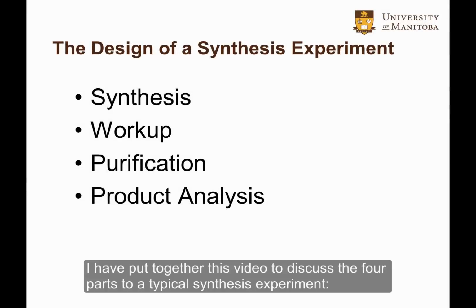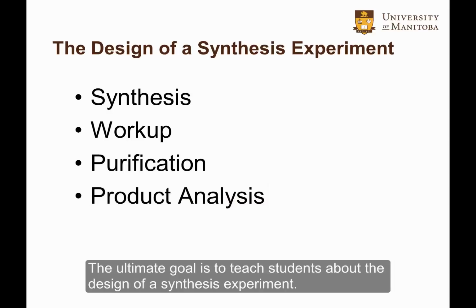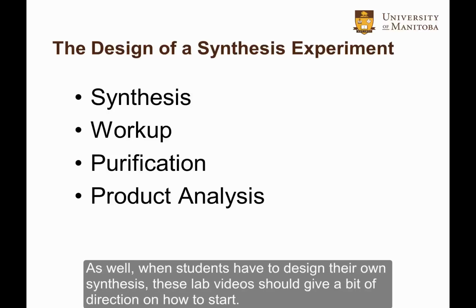I have put together this video to discuss the 4 parts to a typical synthetic experiment: the synthesis, workup, purification, and then product analysis. The ultimate goal is to teach students about the design of a synthesis experiment. After watching all of my videos, I hope that when students read a synthesis, they can appreciate and understand its design. As well, when students have to design their own experiment, these videos should give a bit of direction on how to start.